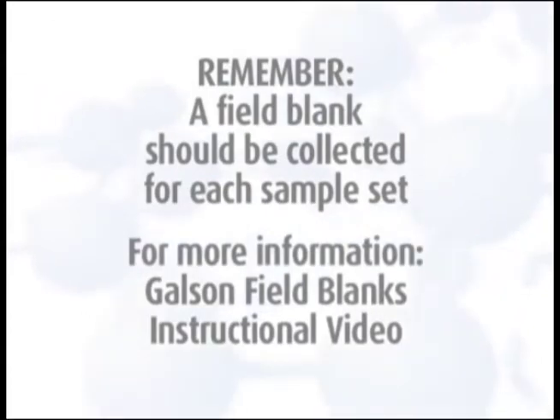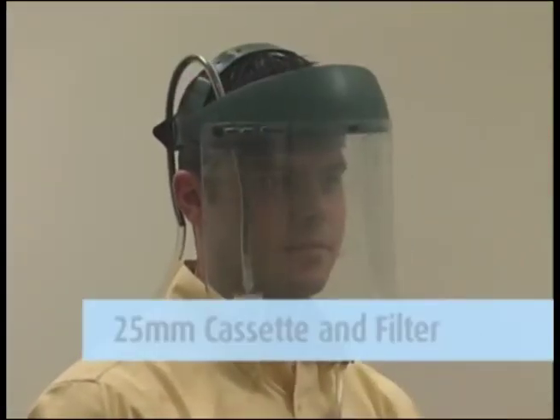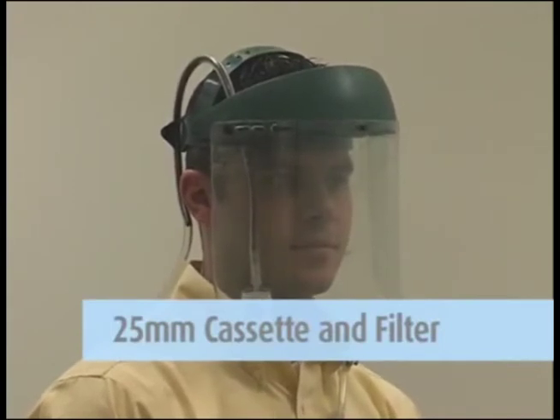For more detailed information, watch the Galson Field Blanks instructional video. If the sample is to be taken under a face shield, use a 25 millimeter cassette and filter with a helmet adapter. This must be requested at the time you order your supplies.